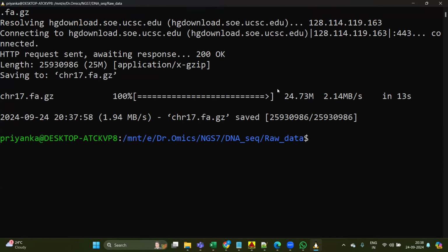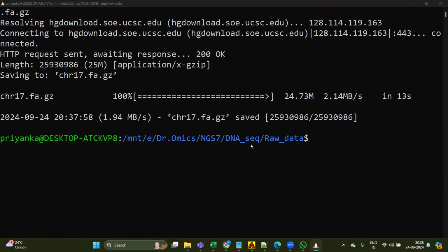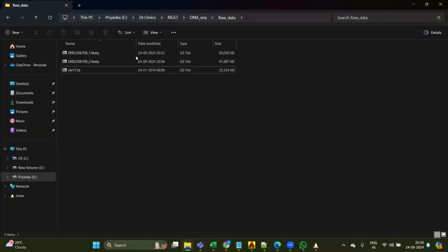Okay then. After downloading these files, maybe you have multiple samples, and that is totally fine.